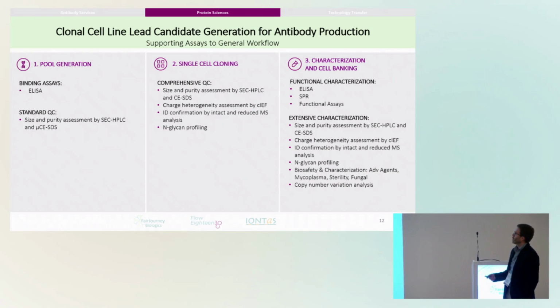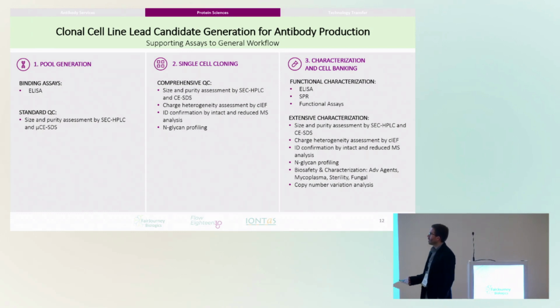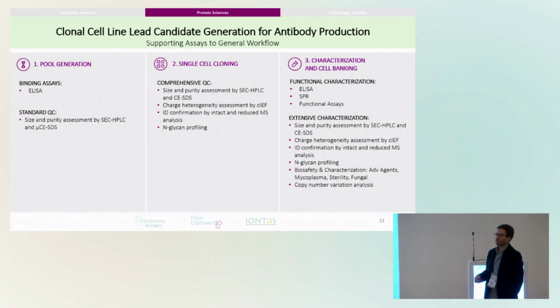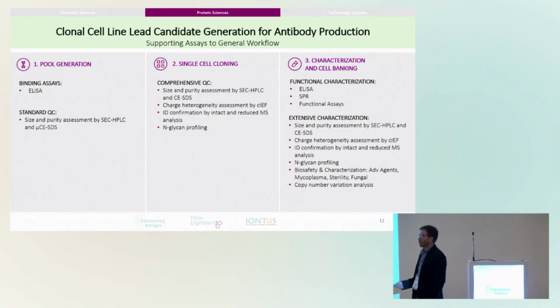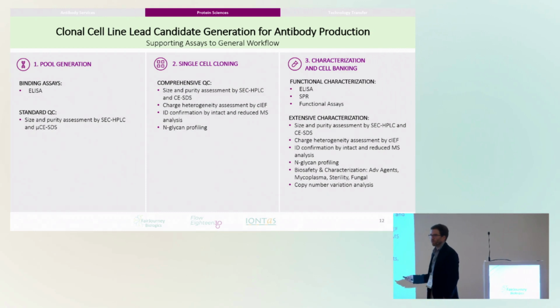So here we have, for the 3 blocks, pool generation, single cell cloning, and characterization and cell banking, the type of assays that we will do for the characterization. Like Teresa mentioned, it's very important to confirm that already at this stage you have everything that you need in terms of molecule characterization, so that we are safe for proceeding in each step.